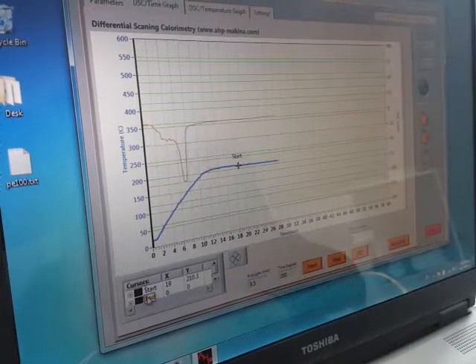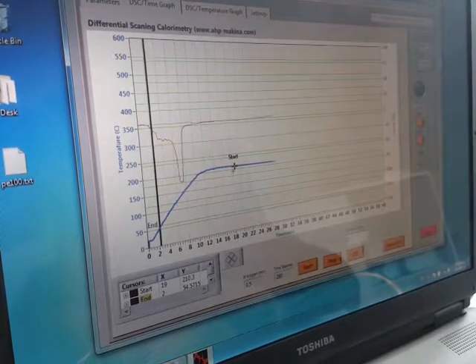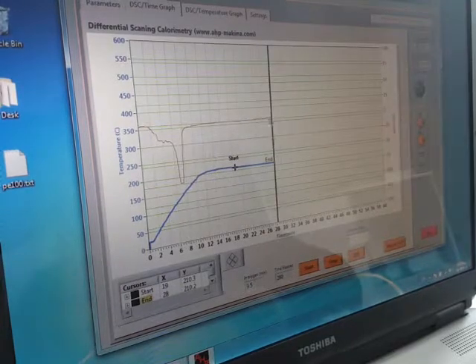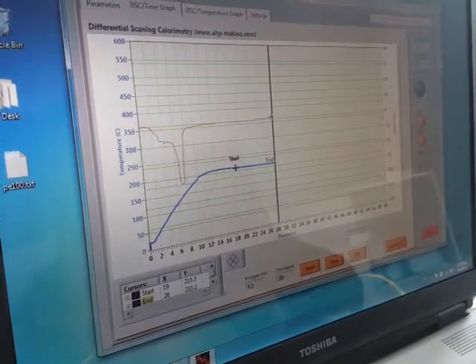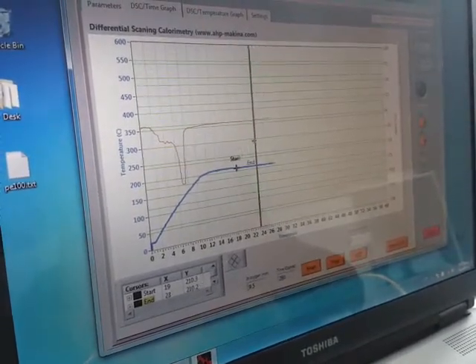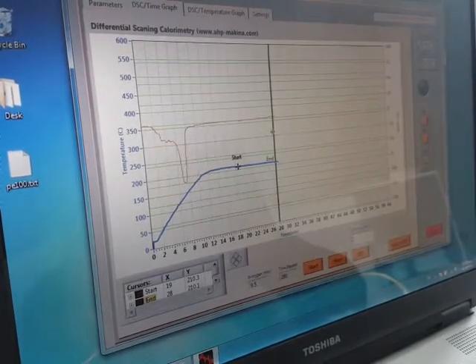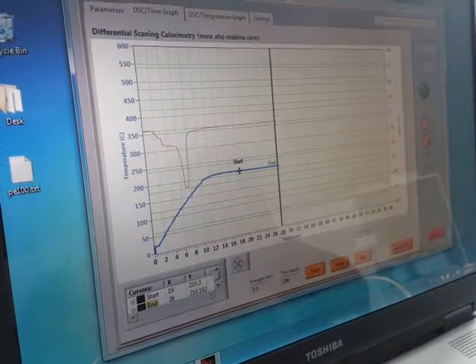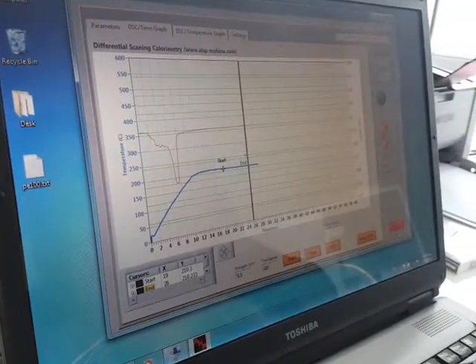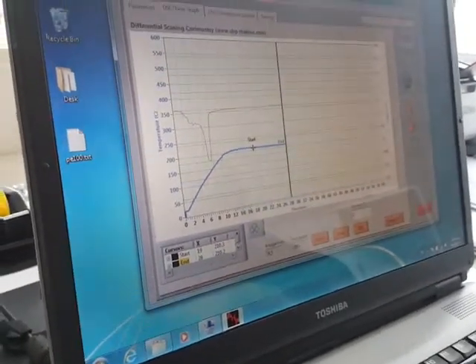You will see the start and end cursor here. Start will be automatically labeled when the oxygen is being input. The end is the breakage point of the DSC. When the material is oxidized, it will break to the upper side, and the operator can move the end cursor to show the breakage point of the DSC curve from the horizontal shape. Suppose that this is a break point. You will put the end line on the DSC.